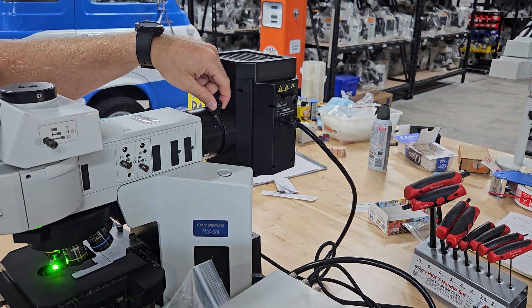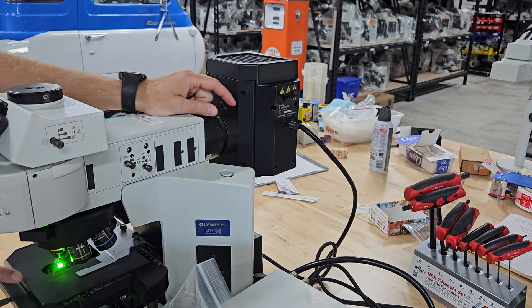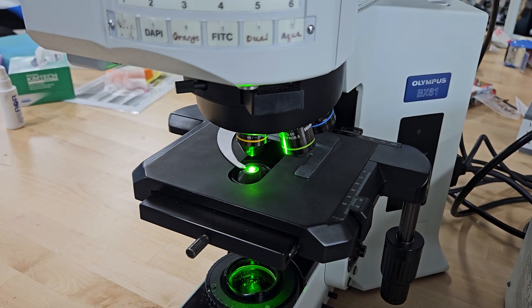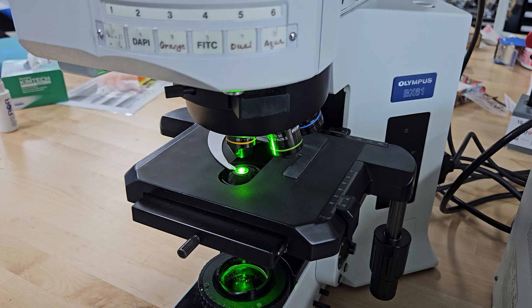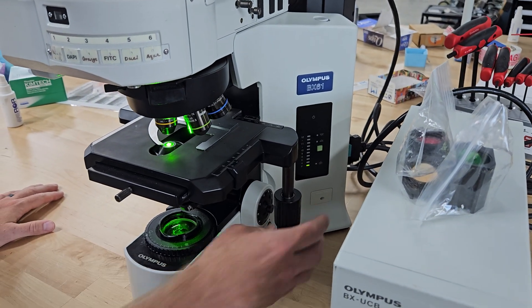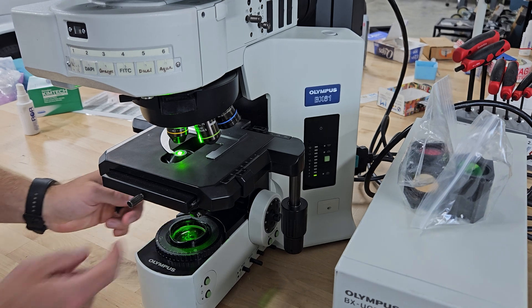Once you get it aligned, you open the collector lens and spread the image. If you look right here at the fluorescent light, you can see it's not aligned — we spread the light. Look how bright that thing is. Same right-handed stage, your nosepiece, your condensers down here.